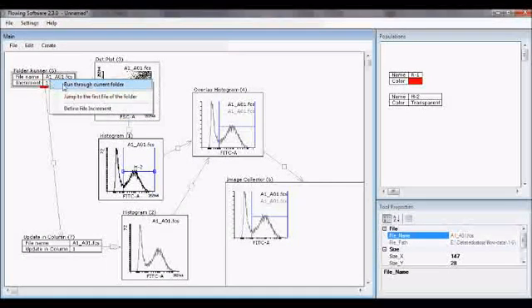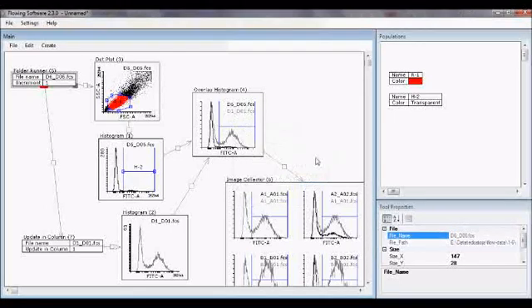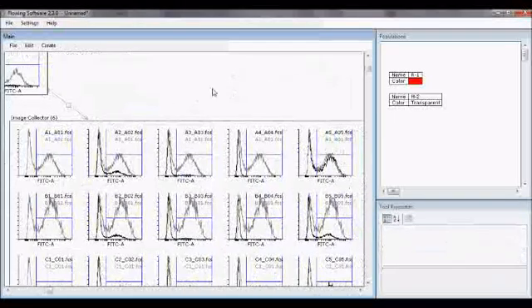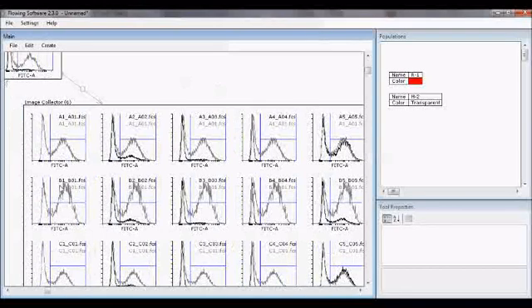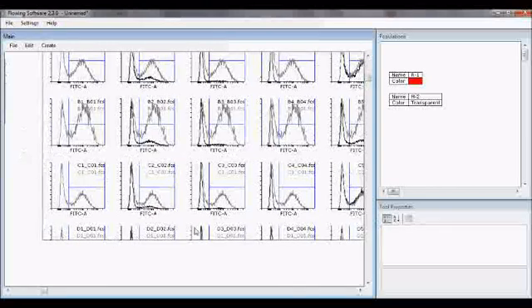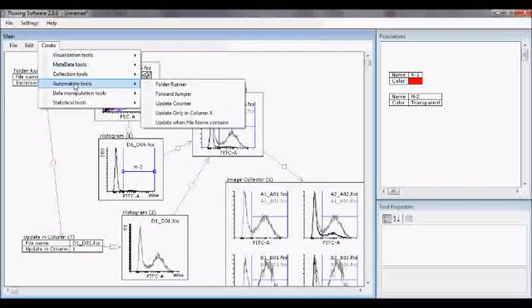So let's check what happens. You can see it always keeps the sample from column 1 as a background, and then when we jump to the next column, it updates it. And C, and the D, and so on. And then you can also make it so that it updates only, for example, every third sample, or when the file name contains, for example, negative or something.